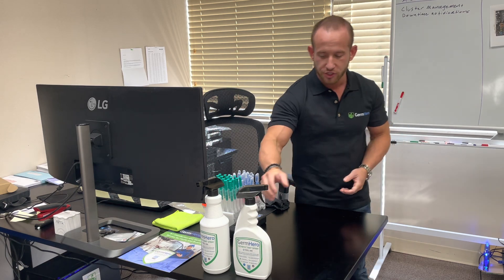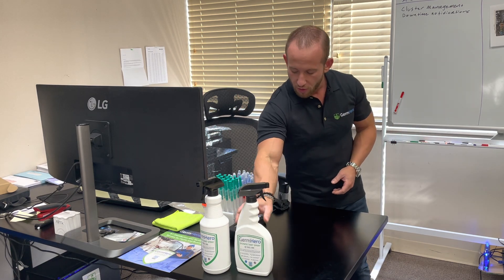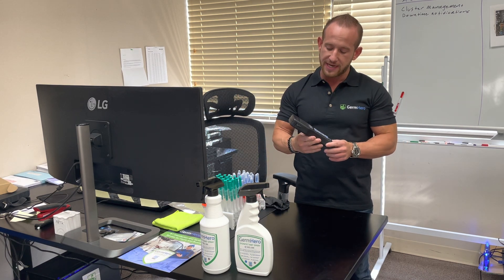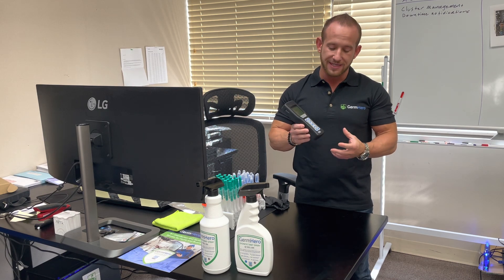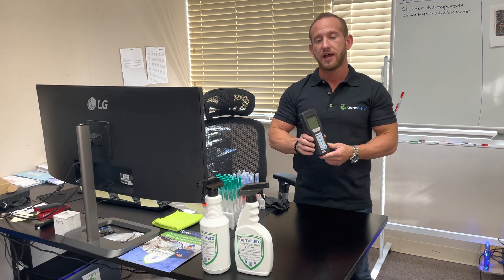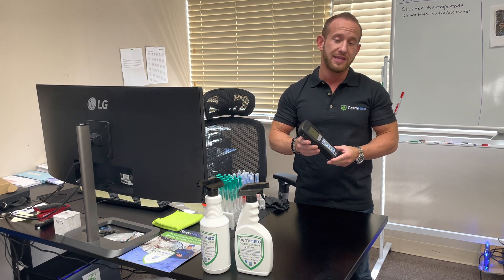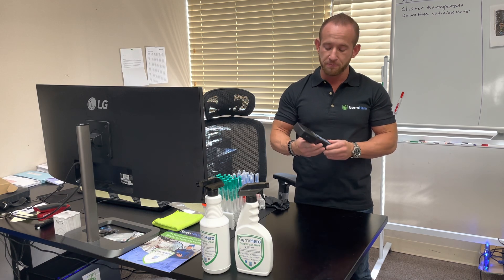What's up guys, Eric Jevaliuk here, co-founder of Germ Hero. Today we are in our Philadelphia office and we're going to be putting Germ Hero's HOCL 500 disinfectant spray to the test. We're going to use a device called a rapid microbial ATP meter, which measures the level of bacteria and live microbials on any given surface or liquid. This is a common device used in the sanitation industry to measure levels of sanitation and contamination.